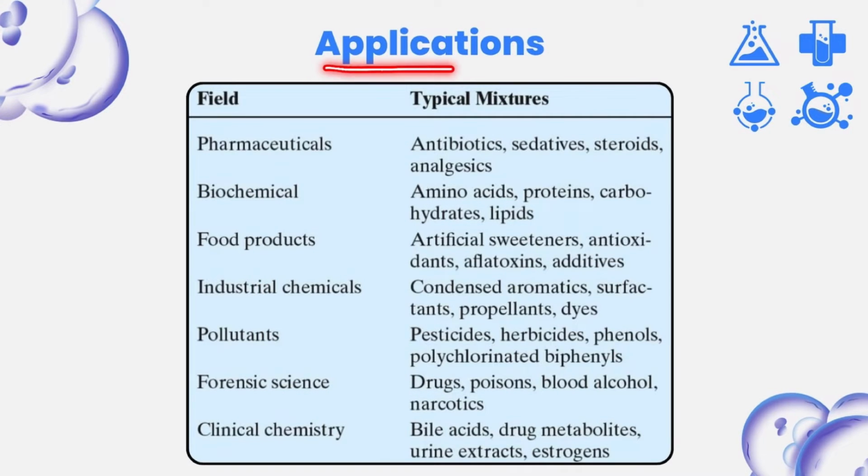So what are the applications of these techniques? Chromatography is used in pharmaceuticals for the analysis of antibiotics, sedatives, steroids and analgesics. Similarly, it is used in biochemistry in order to analyze amino acids, proteins, carbohydrates and lipids.